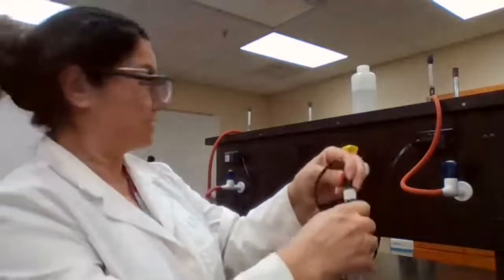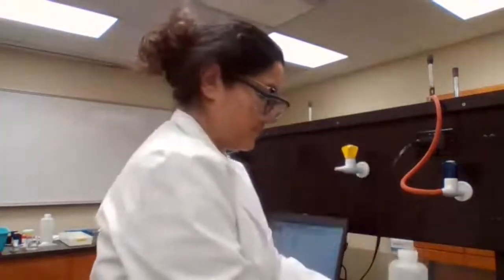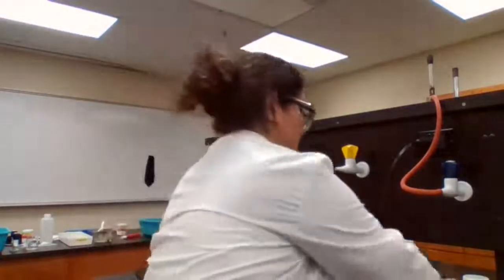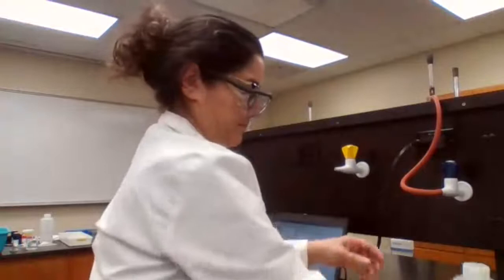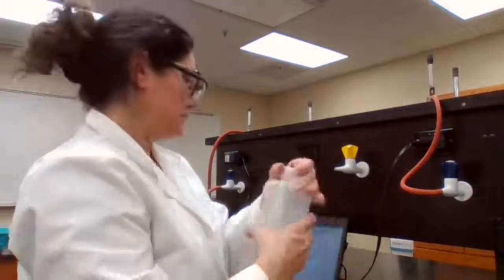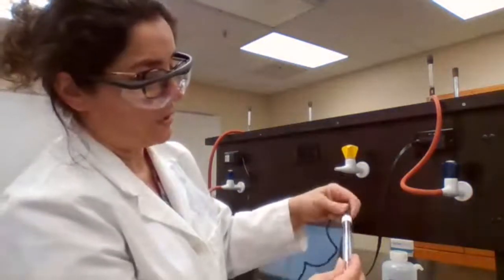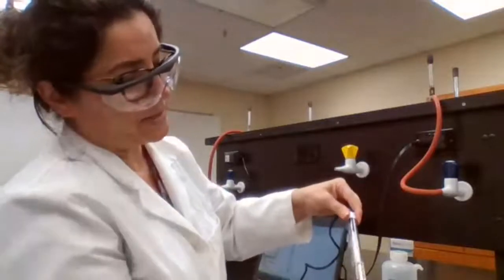Well, I'm not getting any crystals. I'm going to get water, maybe a little bit colder water. Temperature. Maybe it goes to below room temperature and still is in the solution. I don't see any crystals. This is the longest one, and that takes time, but it's understood.